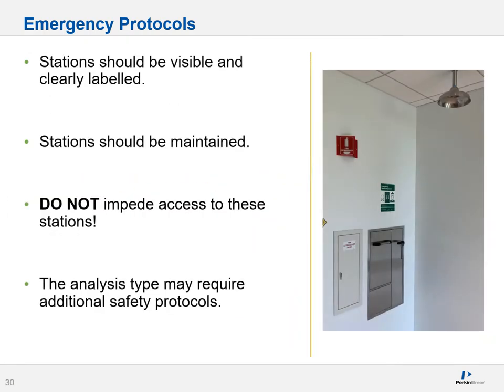Emergency stations should be visible and clearly labeled. They should be maintained — many items need to be checked for operation on a half-yearly, monthly, or annual basis, and usually a professional needs to be hired. Most importantly, do not impede access to these stations. Don't put boxes, pipette tips, or anything around these emergency stations — you should be able to get to them easily from any part of your lab. Remember that your analysis type may require additional safety protocols, such as special hoods or exhaust systems, so consult with your health and safety manager, lab manager, or method.